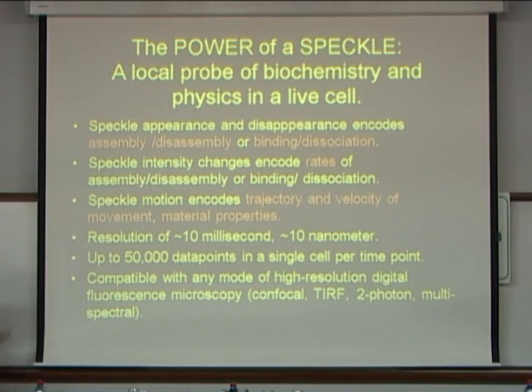In addition, it's simple. It's totally simple. All you need to do is put less fluorescent protein in, and you get speckles. So it's compatible with any mode of high-resolution microscopy that you can do: confocal, total internal reflectance fluorescence, two-photon, multispectral. And as I said, we discovered it by accident.